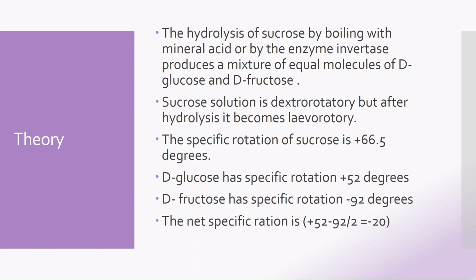Sucrose solution is dextrorotatory, but after hydrolysis it becomes levorotatory. When you hydrolyze sucrose, we form the two components that combine to form sucrose.